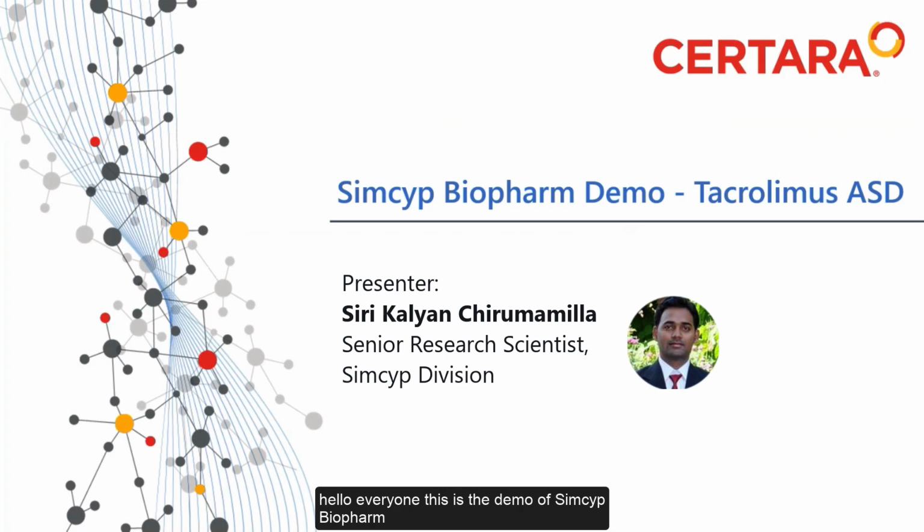Hello everyone, this is the demo of Simcyp Biopharm Software, and in this demo I will be taking you through Tacrolimus amorphous solid dispersion formulation. So in this demo we'll be looking at how the software can be used in setting the specifications, performing risk assessment, and also how the software could be used in formulation design.